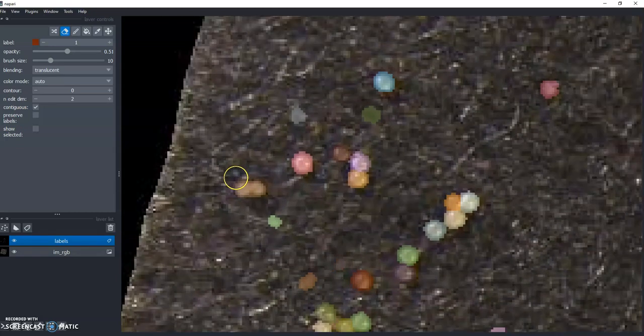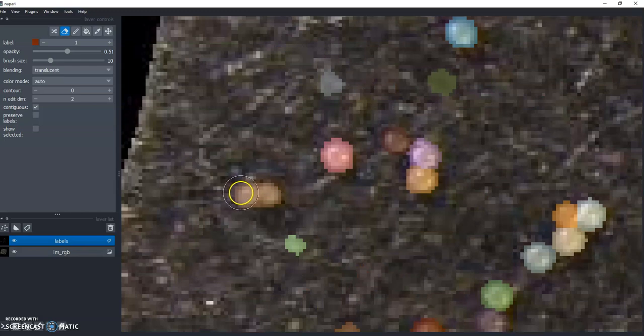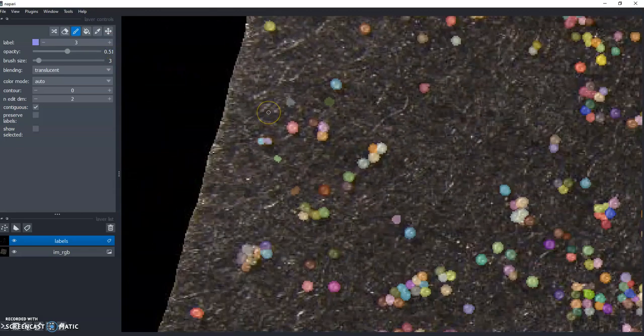And then there's this one here, which is actually 2, so I'm going to redo it. Maybe move the brush size down a little bit. We have to press 2. There we go, we get one of them. Then increment the brush, because this next one needs a different label. It's not perfect, but there you get the idea. So I'm not going to do all of this live. I'm going to stop the recording, and I'm going to go through and correct what I can.